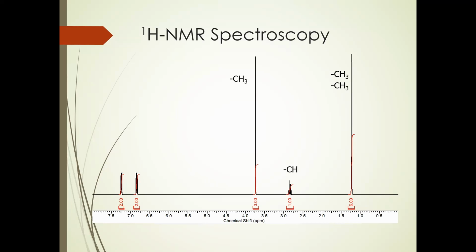And then also those 2 peaks out around 7, integrations of 2. You can't have a CH2 as part of an aromatic ring because we do have the alternating double and single bonds. All of the carbons have basically 3 bonds to other carbons, and so there can only be 1 hydrogen. So we know that must be 2 CHs, same with the other one. And so we know some of the pieces. We know this is an aromatic ring up here. And we know that ring has 2 or 4 hydrogens on it total, which means it's disubstituted. It has 2 other things bonded to that.